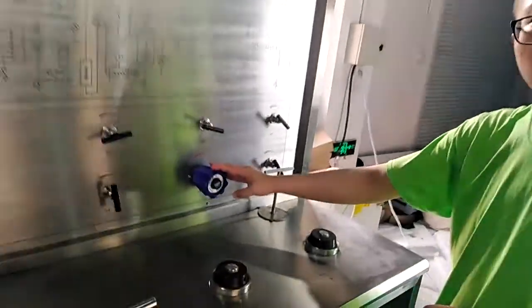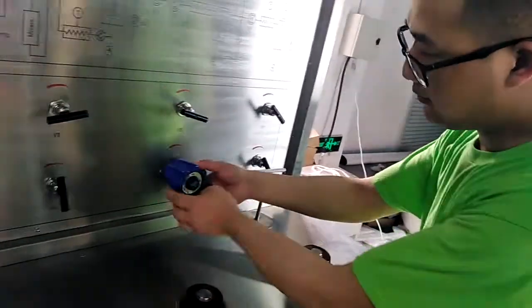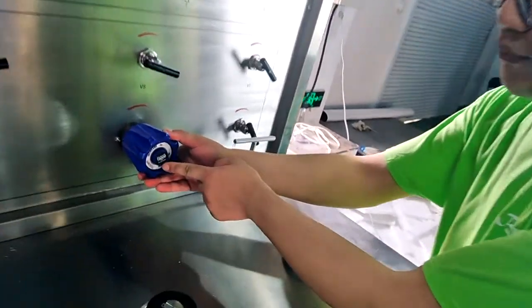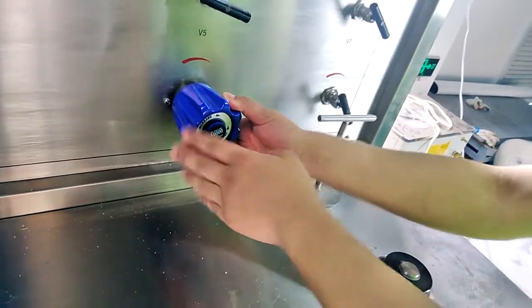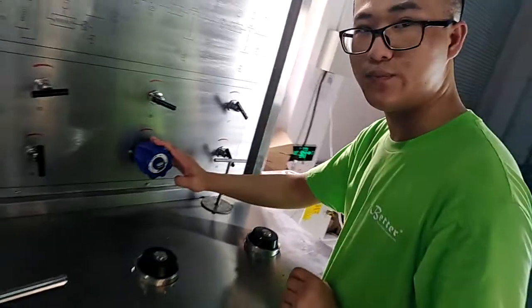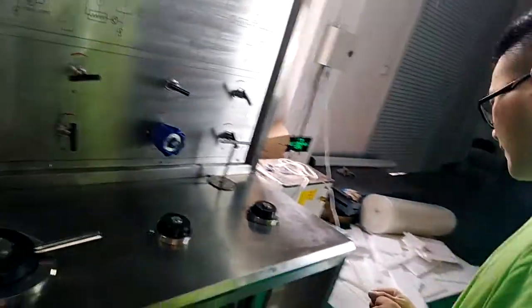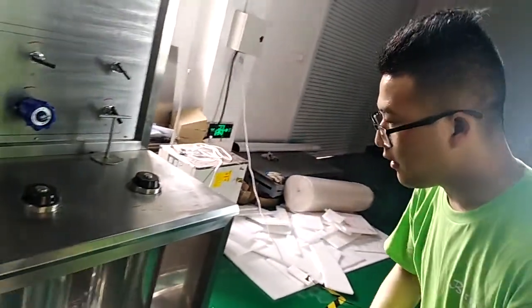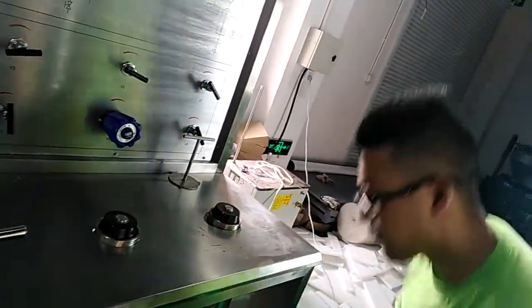Also, see this component — it's a back pressure regulator imported from the USA. It's a Tescom back pressure regulator, which will help us to precisely control the pressure of the extraction vessels and the separation vessels.